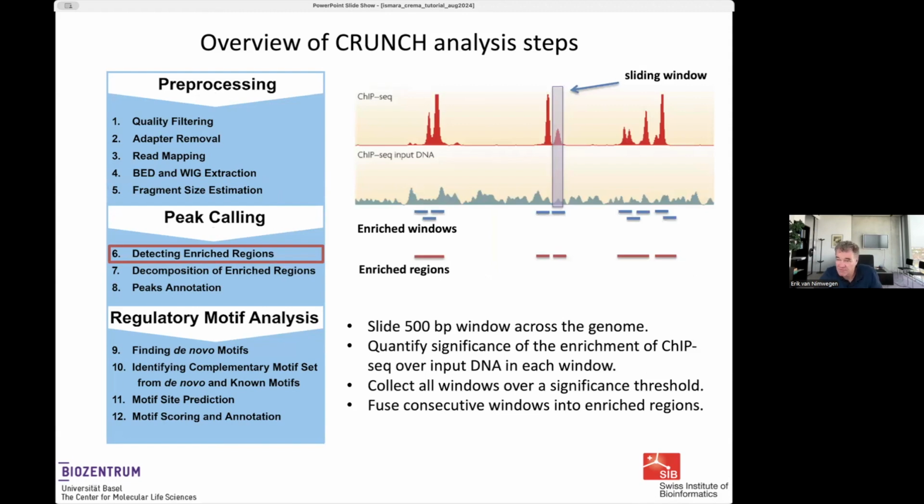Okay, so from this, we end up with basically a measure for each sample along the genome of, at every position in the genome, how many fragments overlapped this position in the genome? What is the sum of the number of fragments? And now we need to use that data to find regions in the genome that are enriched, where there is a surprisingly high density of fragments.